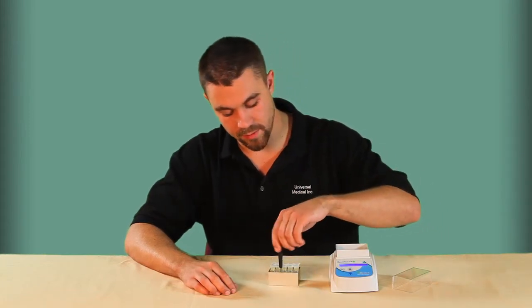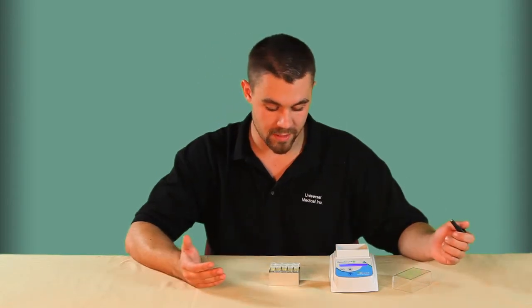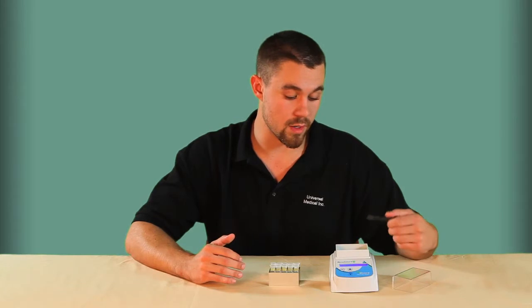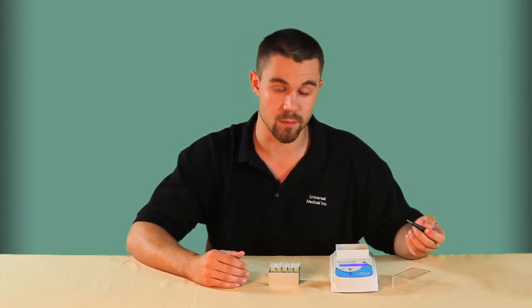And here I have the block lifter which allows you to take the block out if you want it to cool off faster or maybe you want to start another dry bath. You can take this one out and replace it with another block.